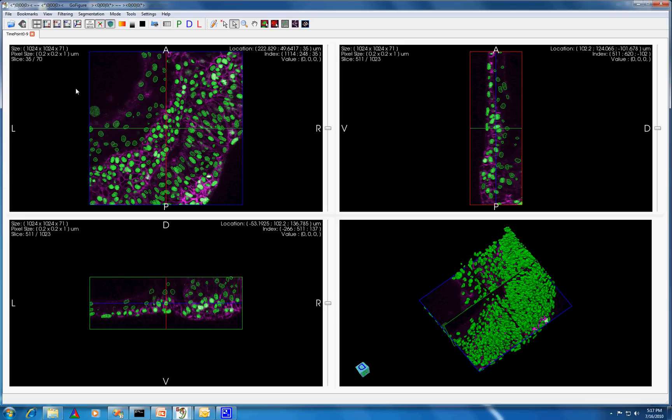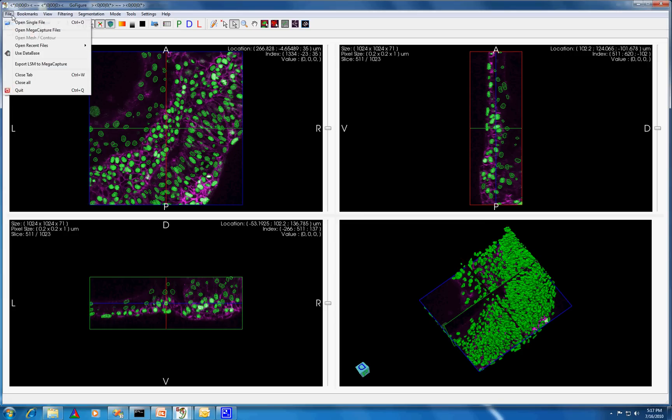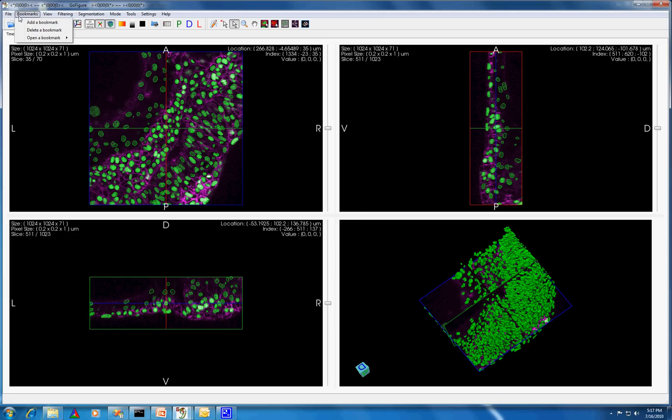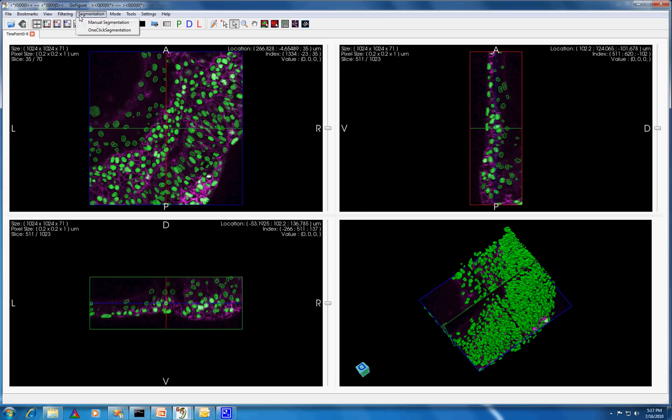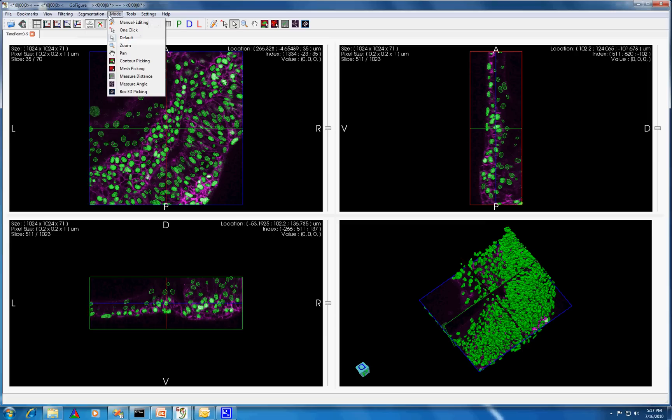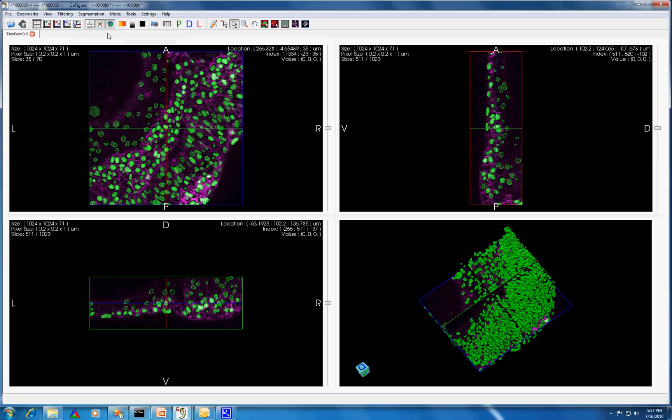One aspect of the Digital Fish Project is the creation of a software package called GoFigure for visualizing and processing 3D time-lapse microscopy data. In this video, we'll highlight some of the major features of GoFigure and show you how you can analyze your data with it.